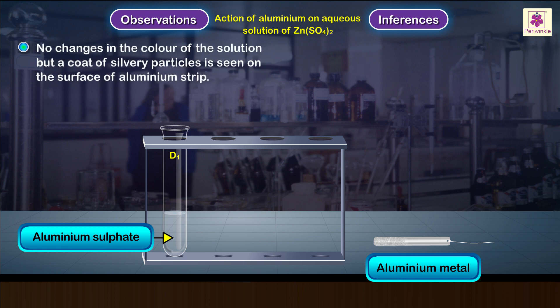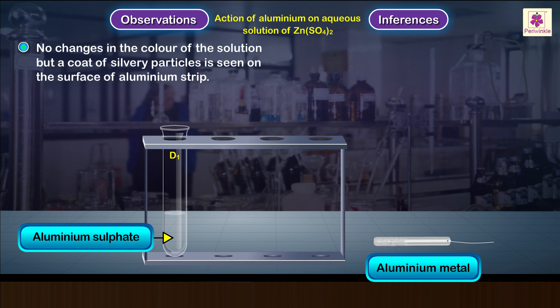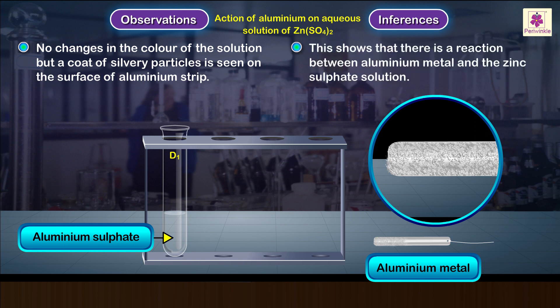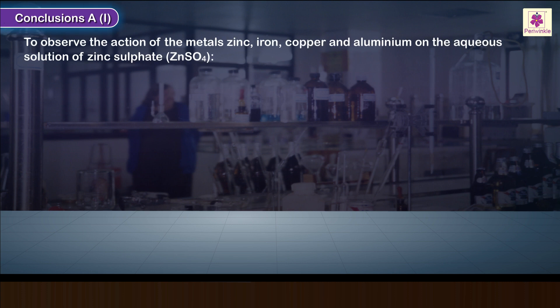Test tube D1 containing aluminum metal: no changes in the color of the solution, but a coat of silvery particles is seen on the surface of the aluminum strip. This shows that there is a reaction between aluminum metal and the zinc sulfate solution. Conclusions A1 noted.